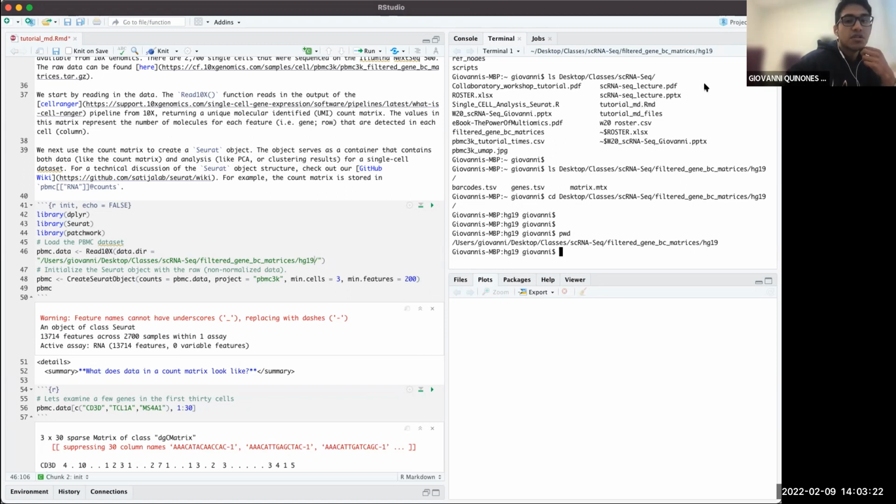There was another question. Oh, okay, yeah, so somebody typed that for PC, you need to replace the backslash with the other slash in the directory name. So you're talking about this path.